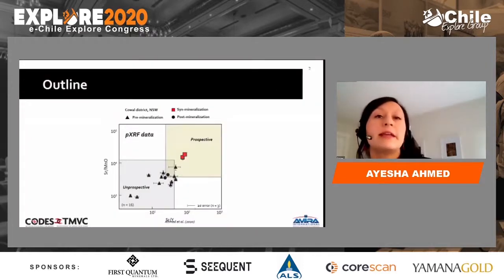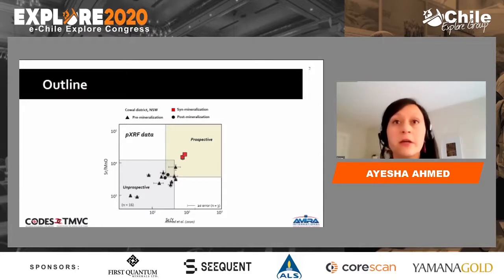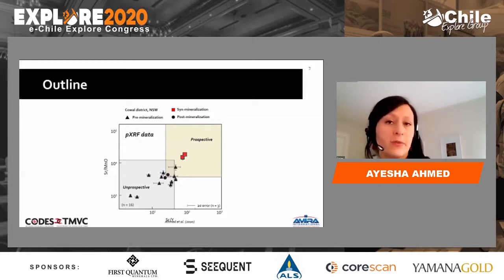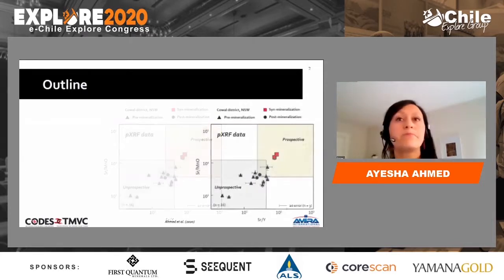What I'll present today is a PXRF workflow that can be undertaken in the field or after a field campaign to get cheap, reliable, and reproducible porphyry fertility information, specifically for intact rocks. So just like you see on the graph shown here.